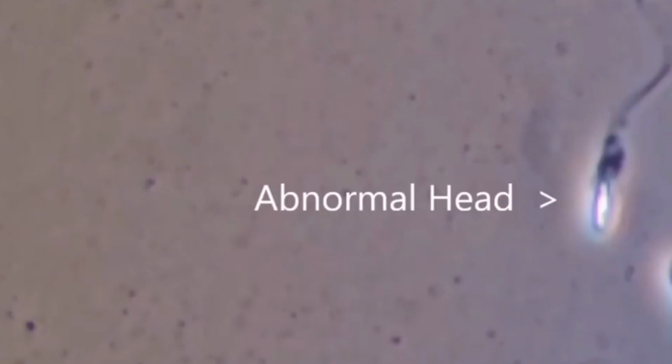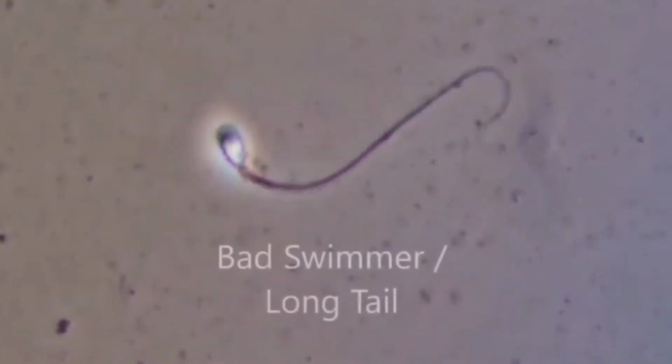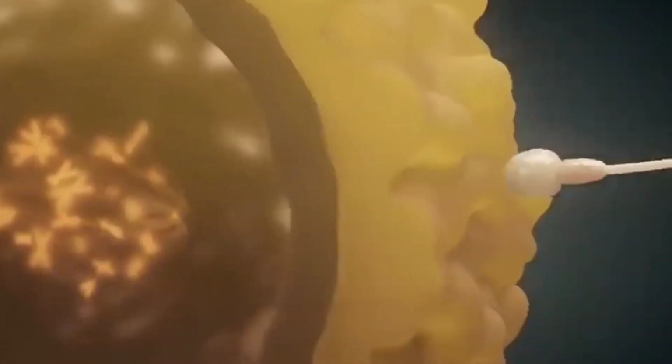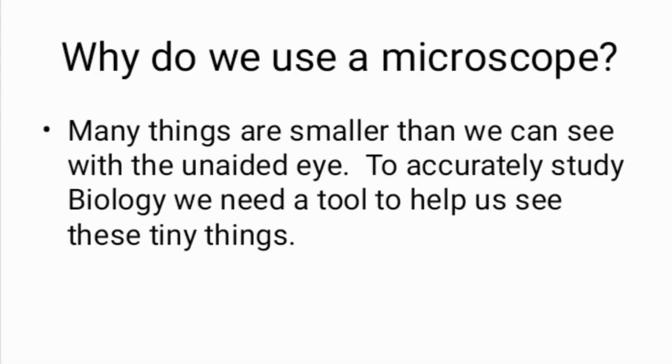So, next slide. Why do we use a microscope? Based on the previous definition of microscopy, you should be able to point out at least 2 things, or to tell us a little about the use of the microscope. Many things are smaller than we can see with the unaided eye.